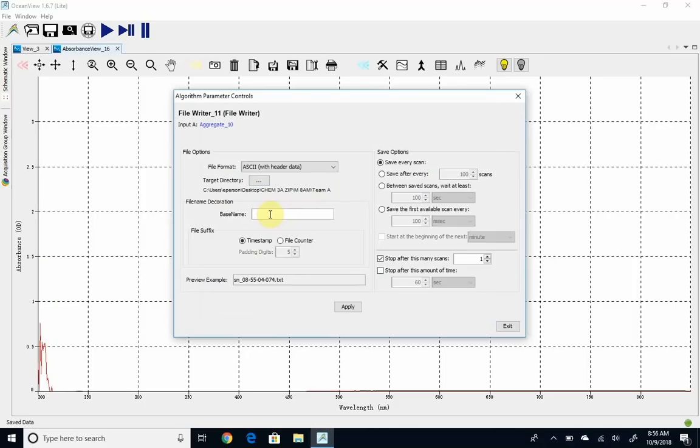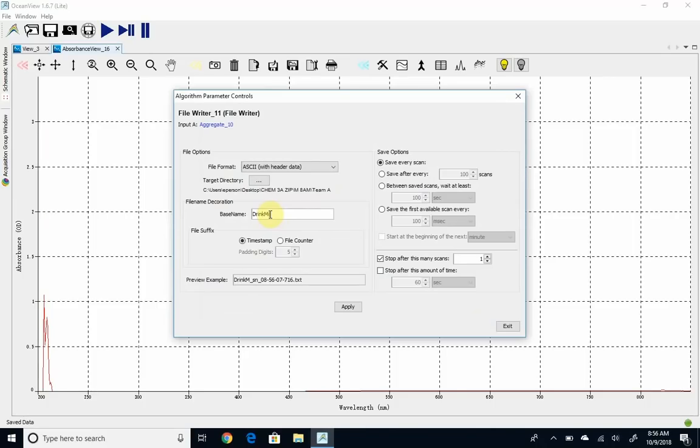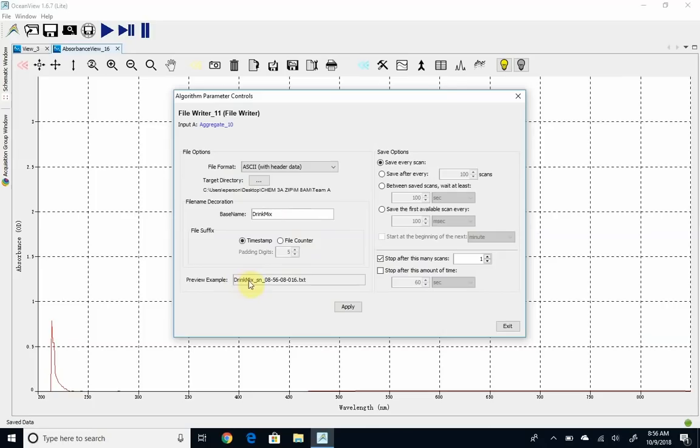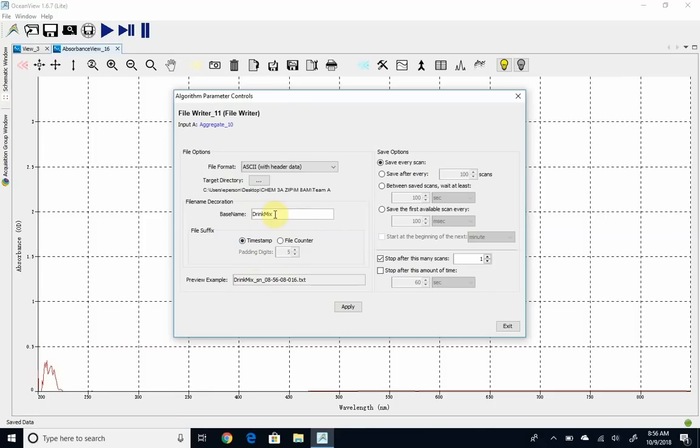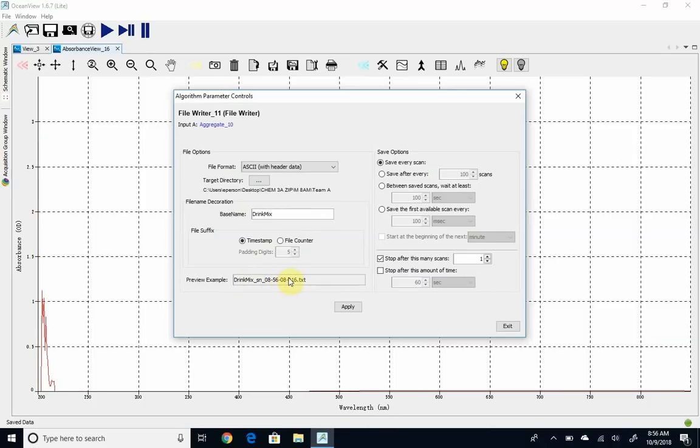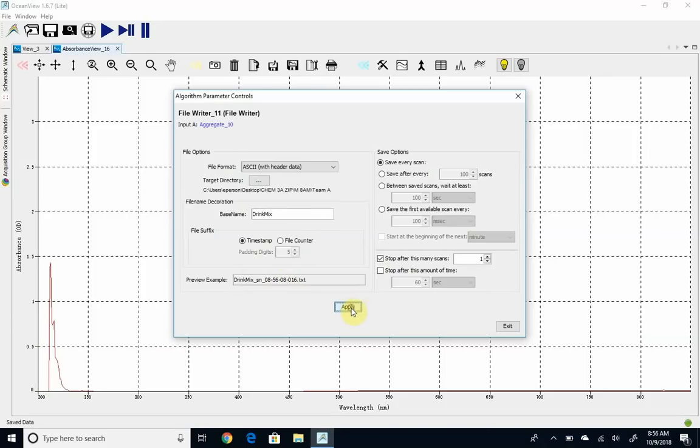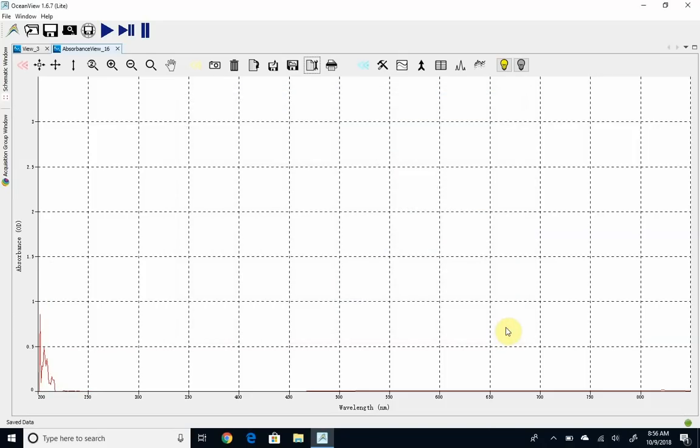The other thing I'm going to do is give it a base file name. So I'm going to say this is my drink mix. The file names will get that base name, so you could use it to distinguish different sets of samples you run, or you could put team A here if you wanted. And then 8.56 a.m. and 8 seconds. So that time stamp is going to help you know which sample you've just run. Go ahead and click apply, and exit.